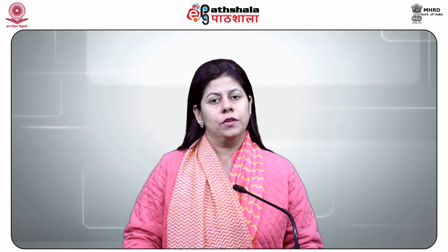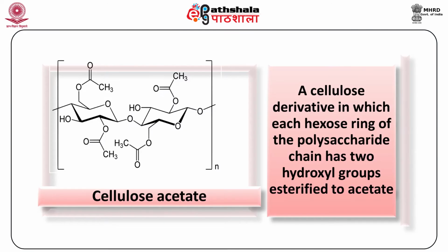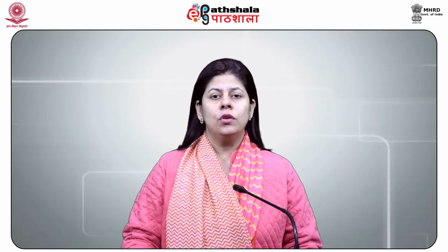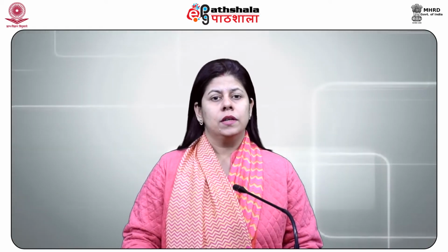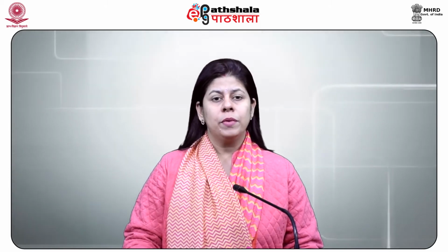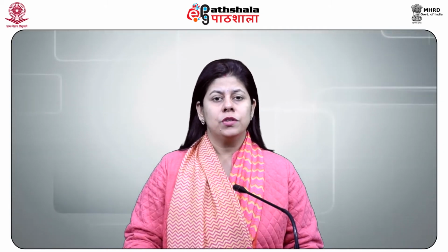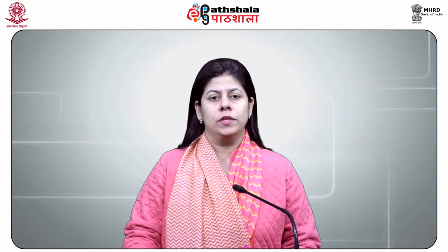Common mediums used in electrophoresis. First, cellulose acetate. Cellulose acetate is a cellulose derivative in which each hexose ring of a polysaccharide chain has two hydroxyl groups esterified to acetate, in general in the C3 and C6 positions. Cellulose acetate is quite prevalent in clinical chemistry as it offers a convenient support that can be equilibrated with buffer in a few seconds and yields good separation of proteins from biological fluids.